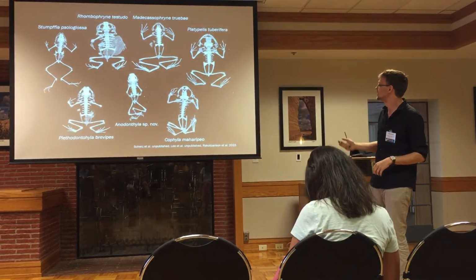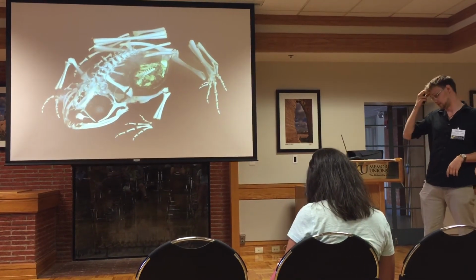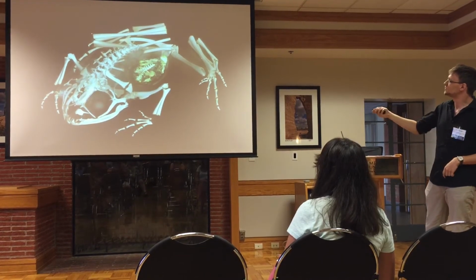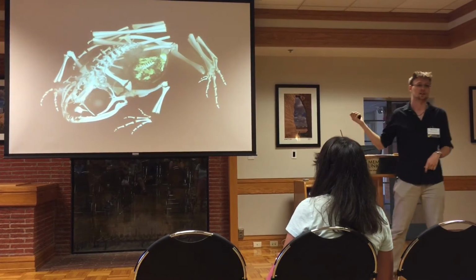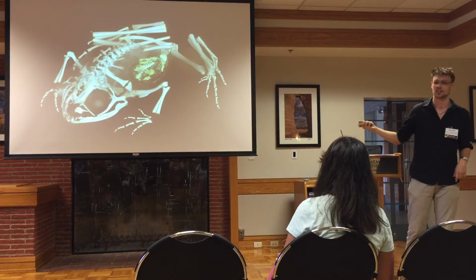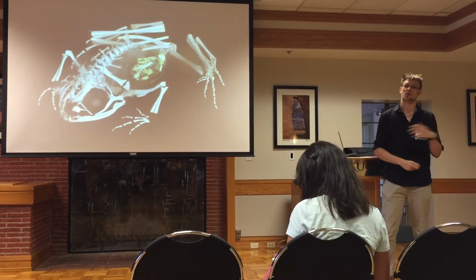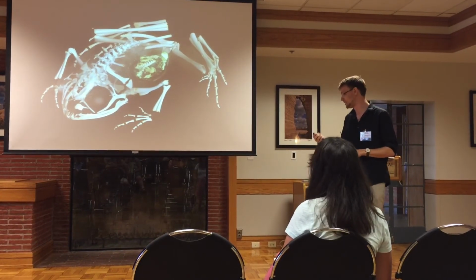And another really exciting thing is this guy. So we scanned this frog, looked at the stomach, and said, hey, that looks awfully like a spinal column. Is that a leg? Those are some bones. Yeah, that's a frog in the stomach of the frog. So you can take the skeleton out of the frog and look at it, and yeah, that's actually a frog inside the stomach of this frog. So there's a whole new frontier of the ecology of the frogs that we can study just by looking at the micro-CT images of them.